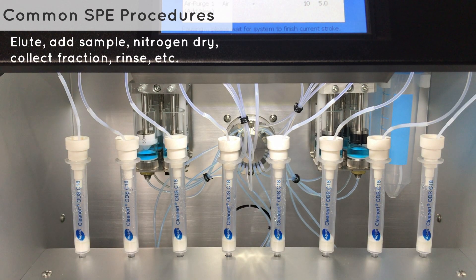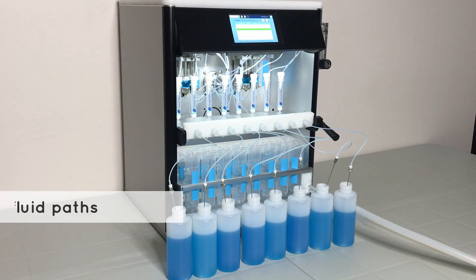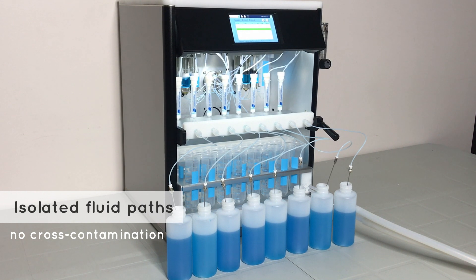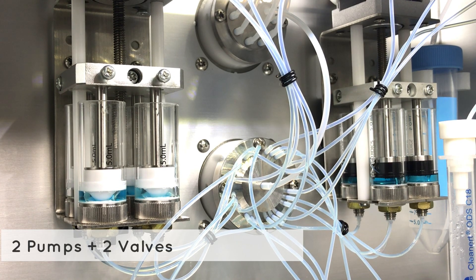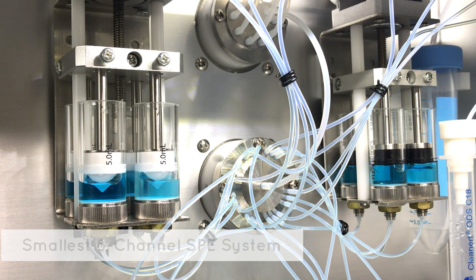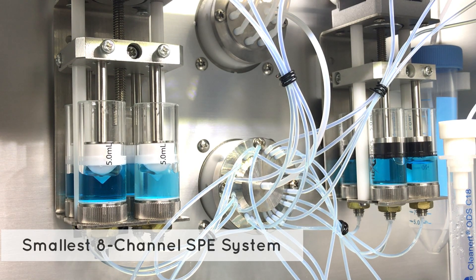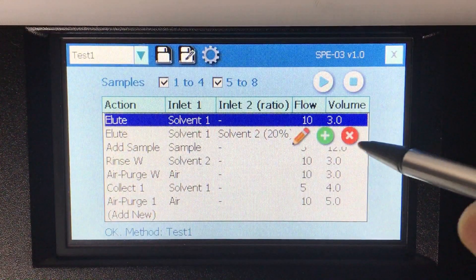The SPE03 can perform all common SPE procedures accurately at your desired flow rate and volume. Each sample has its own pump, syringe, and valve channel to eliminate cross-contamination. The system uses only two pumps and specialized valves for all liquid handling, making the SPE03 the smallest 8-channel SPE system of its kind.